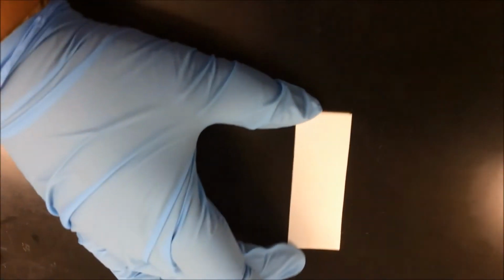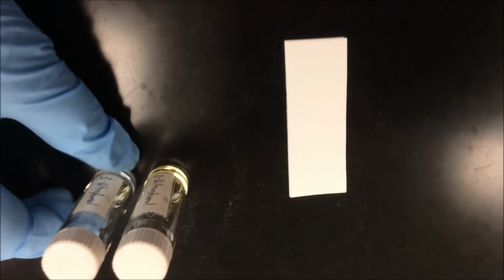Now, when you come into the lab, you will find these TLC plates, and they will look like these. These are pre-cut for you, and we are going to spot the two components of our mixture that we are going to run a column chromatography on at a later time. My two components are orthonitrophenol and metanitrophenol. So I have here my two unknowns. This is the 2-nitro, or the orthonitrophenol, and the second one is the metanitrophenol, and I'm going to go ahead and spot these on the TLC.